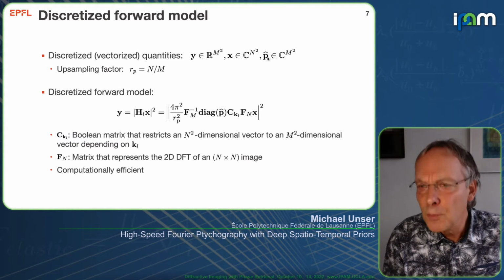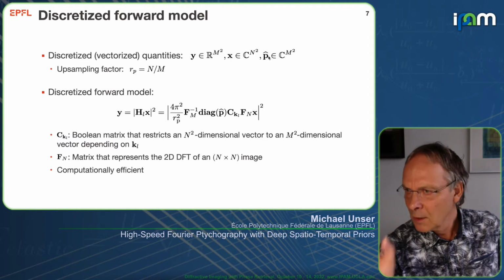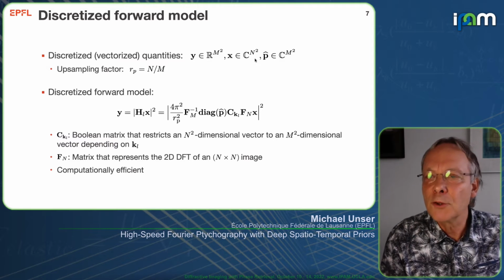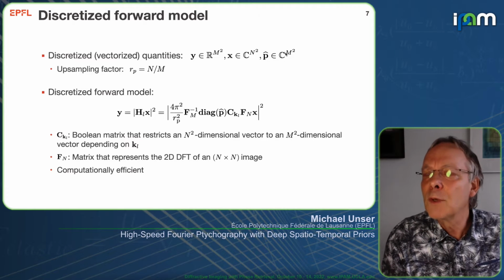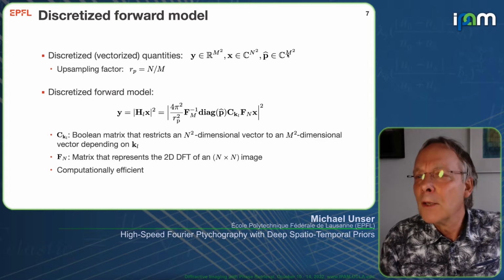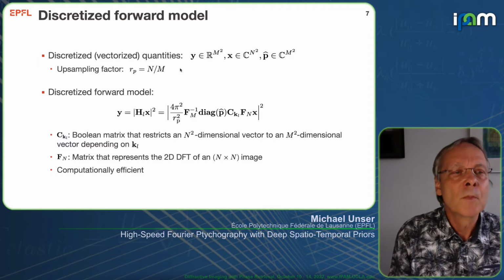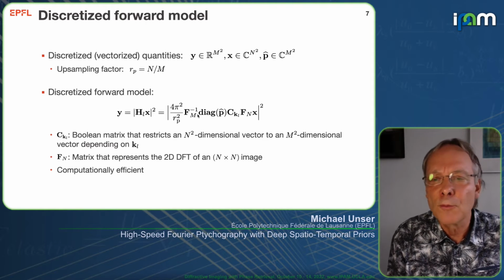And then now the pupil function, okay, the pupil function is really acting at the output of the microscope, so it's acting on those measurements. And so the pupil function, which we apply in Fourier domain, we will also represent in a discrete fashion by an m by m complex image in Fourier domain.